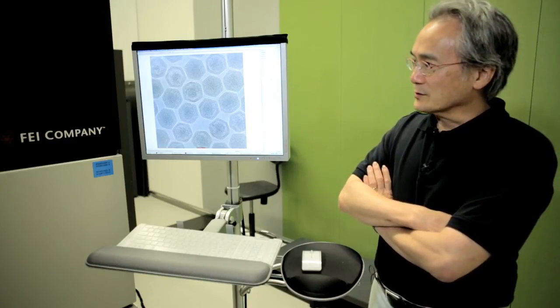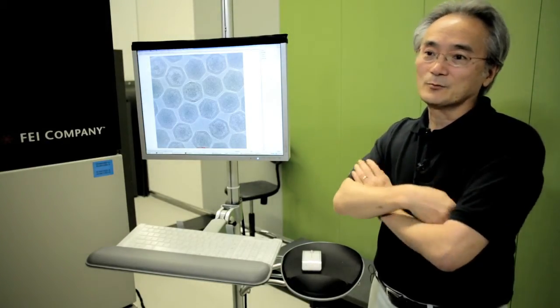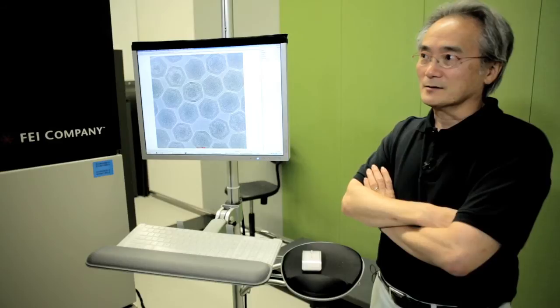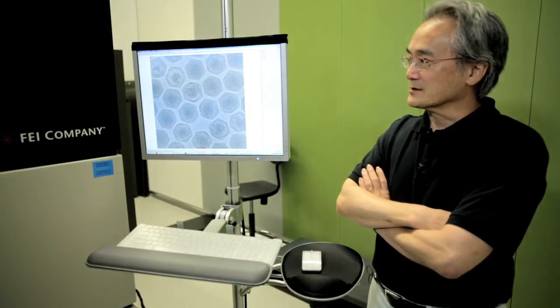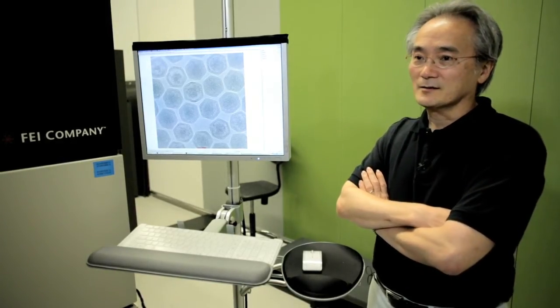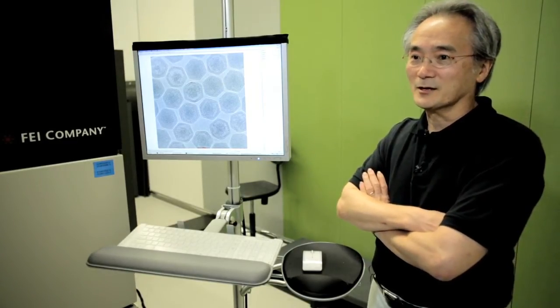But more importantly, we use this microscope to study many other things. One of the big projects here is a project to study dengue virus. This is led by an assistant professor at Duke NUS, Professor Shimei Locke.